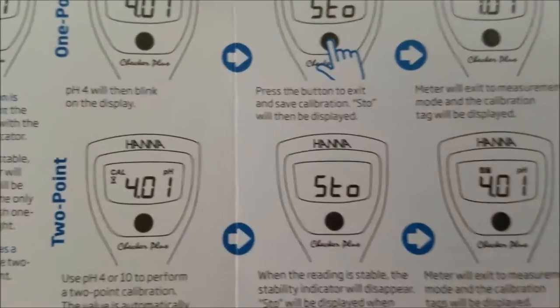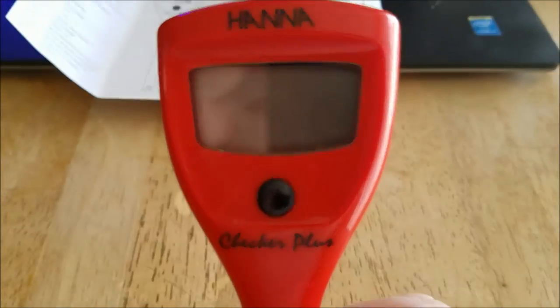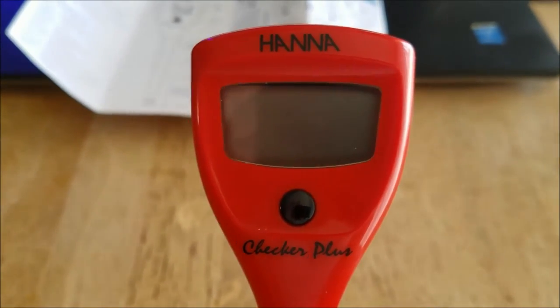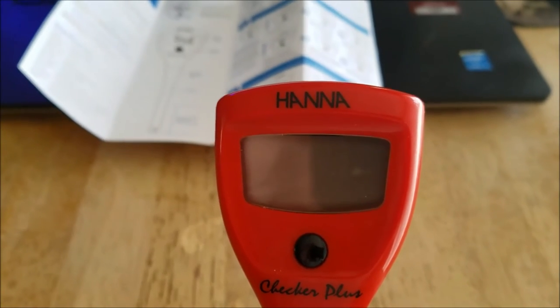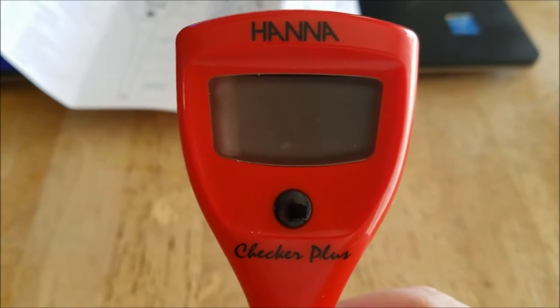As far as my opinions on this are concerned, I'm happy with it. I'm trusting its measurements because I know what my tank usually runs at and it's within that range. What I can do now is take you over to the tank and show you exactly how to measure the pH on your system.